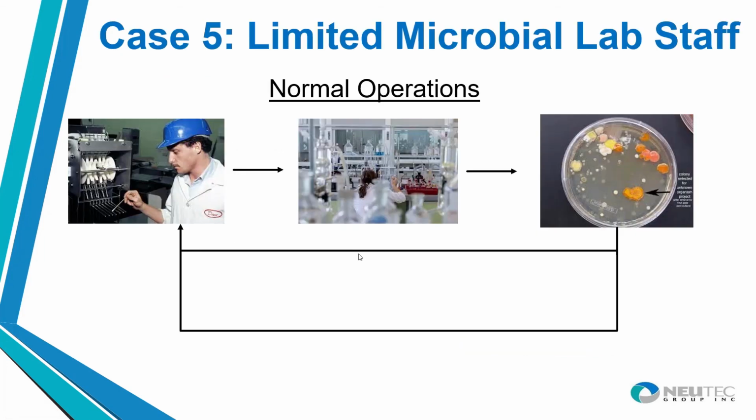And so that requires a challenge test. That's a little bit more involved. So it has to be sent to a microbial lab, and they may have a central laboratory that does their micro testing. And so they send that off. They take it and do their micro test to look for the presence of these colonies. And normally they get results back in about 2 days. And so they're just down for a little bit while they wait for those results. And then once they get them, they can go forward.